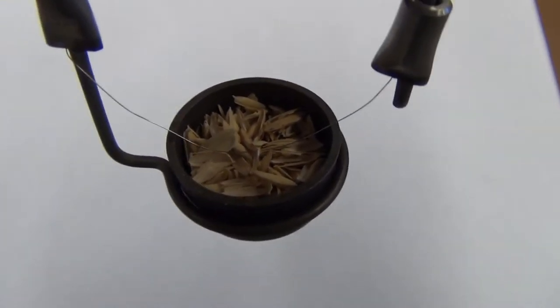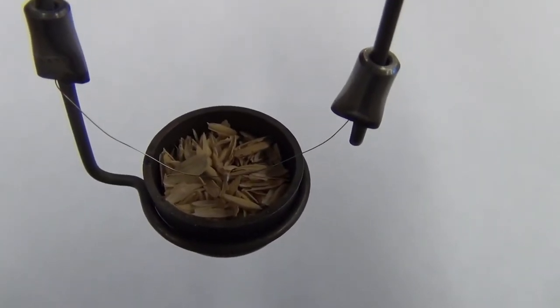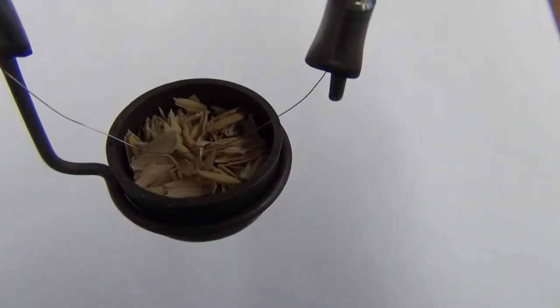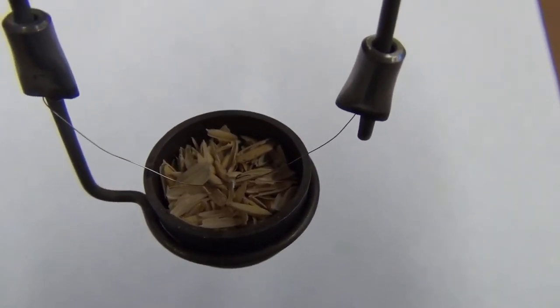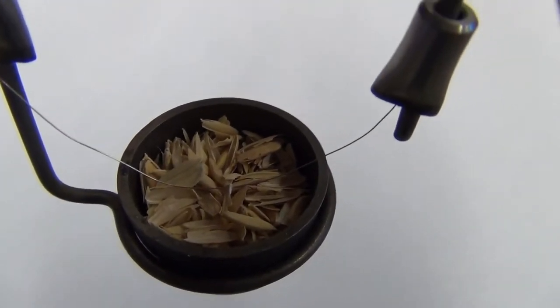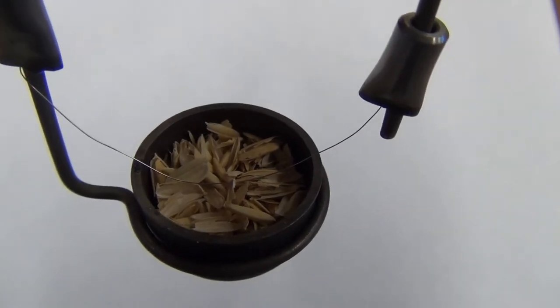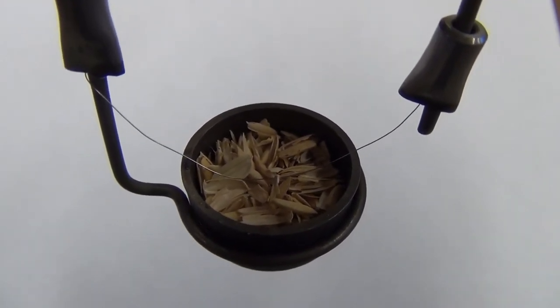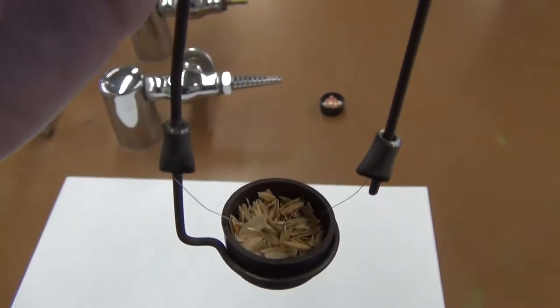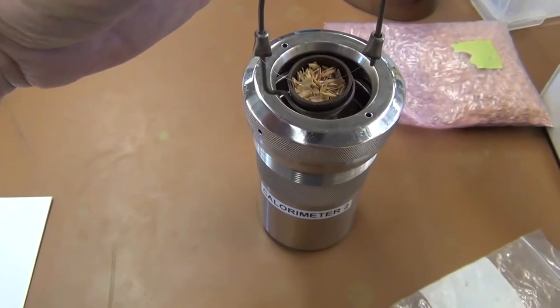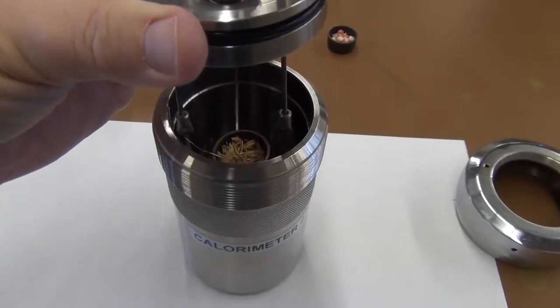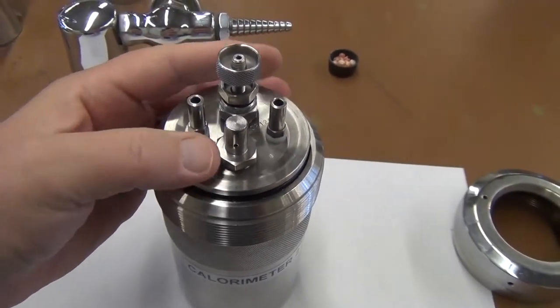In past experiments we've done pop-tarts, peanuts, actual fuel, even foam rubber. Pretty much anything can be burned in here, but ultimately we try to do something that's consistent, has a good higher heat value and can be reproduced. You'll notice that the nichrome wire is touching the fuel. This is so that when we put the thing all together we guarantee combustion. We place the sample in the bomb, careful not to spill anything, and push down.